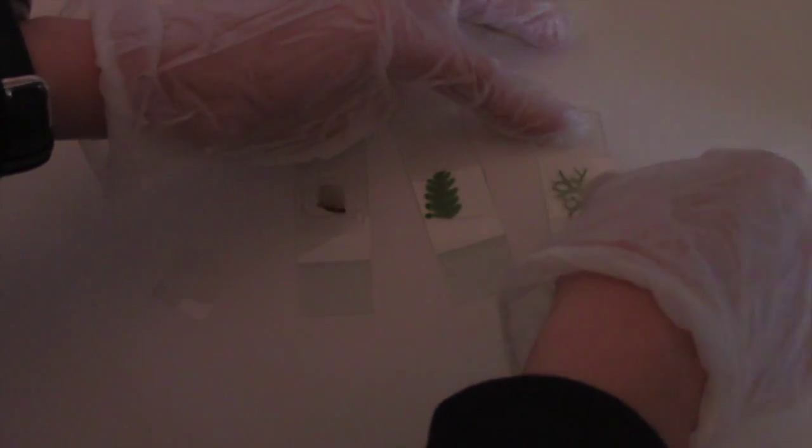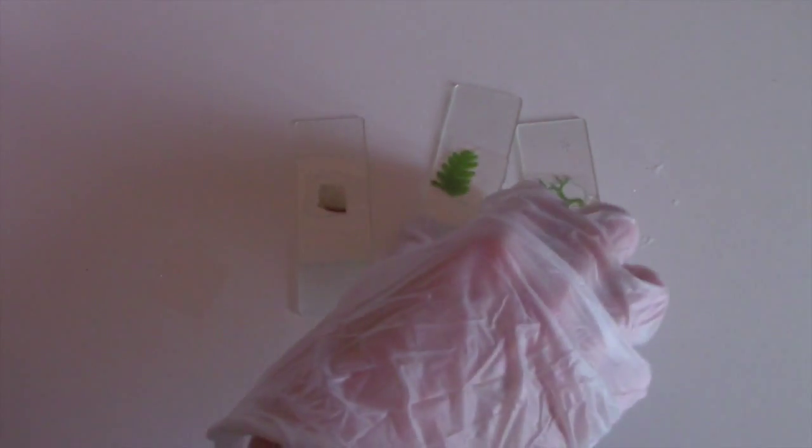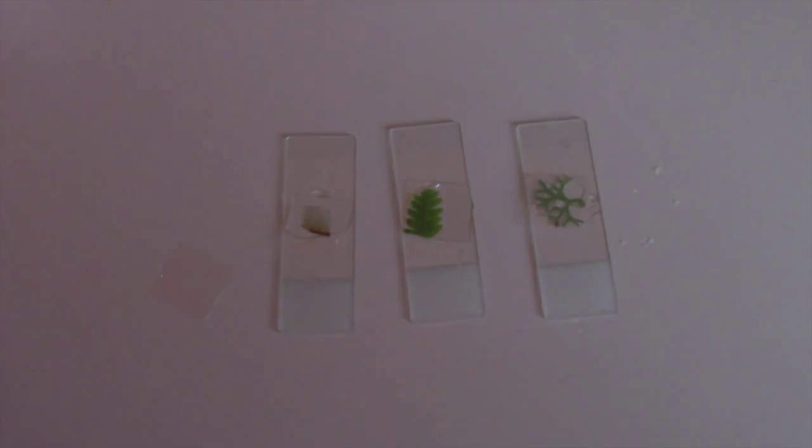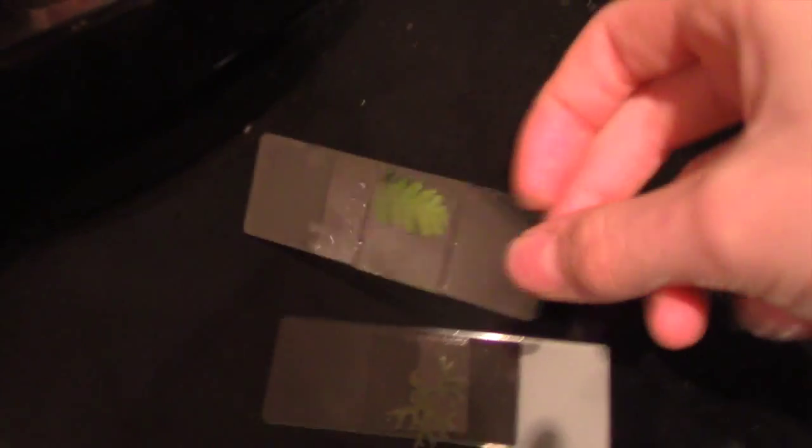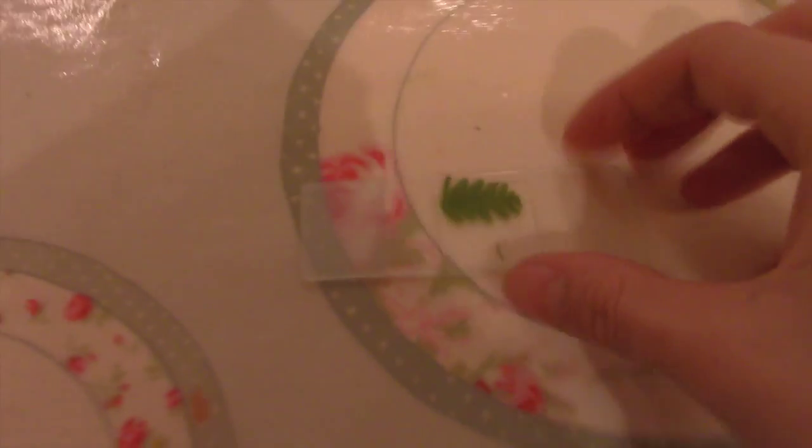Now we're placing the cover slips very gently over the top. Remember to put the glue back in its case. I've put the slides on the Aga — or the cooker — to dry. We've got the fern and the algae slides drying there now.